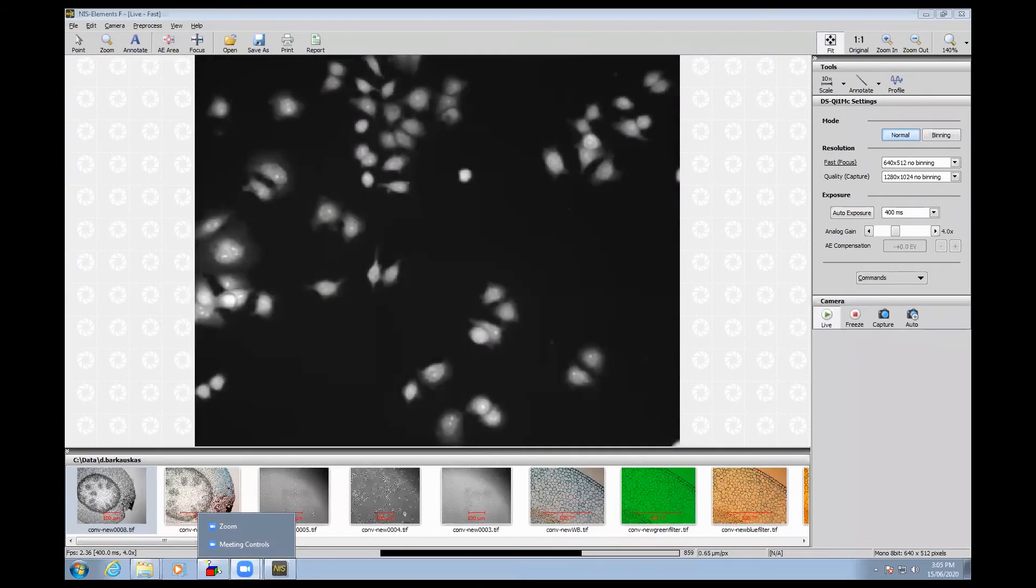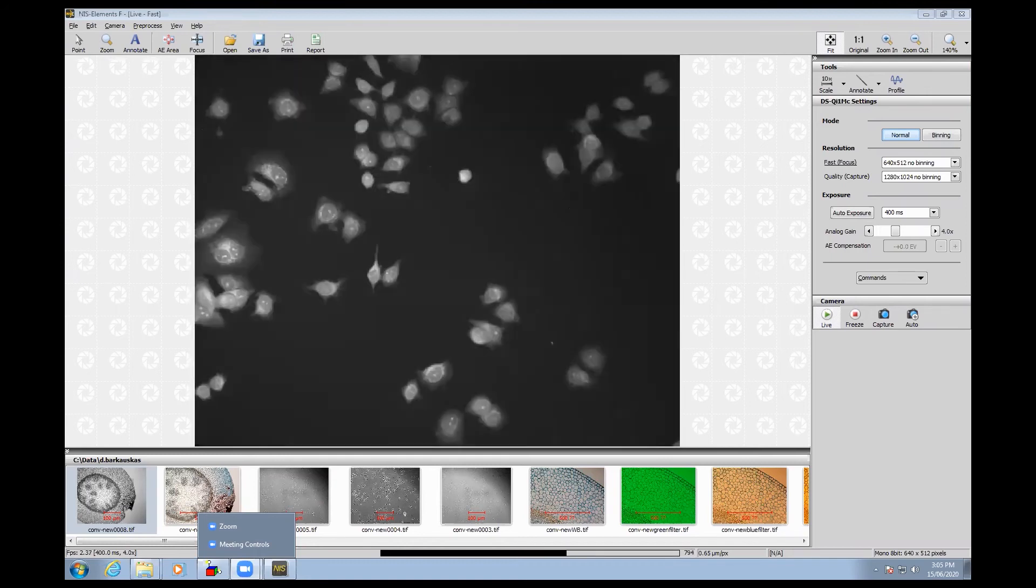Close the shutter, change filters, open the shutter, and observe the different fluorescently labeled structures in your sample.